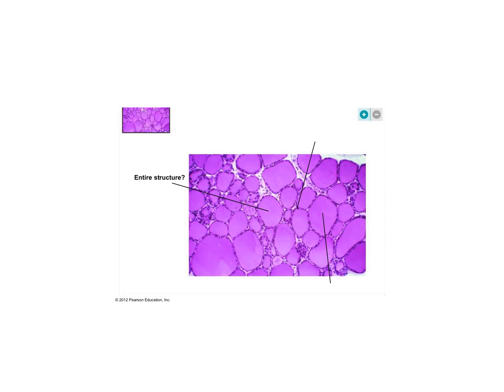All right, the thyroid. The thyroid produces hormones that are known as T3, T4, and calcitonin. So if we looked at the thyroid underneath the microscope, it looks like a bunch of pools. Like here's the rim around one pool and this lighter stuff that's on the inside. This one section that I'm outlining with the pointer right now, that is called a follicle. So this is a thyroid follicle. The cells that go around the outside, those are the follicular cells.